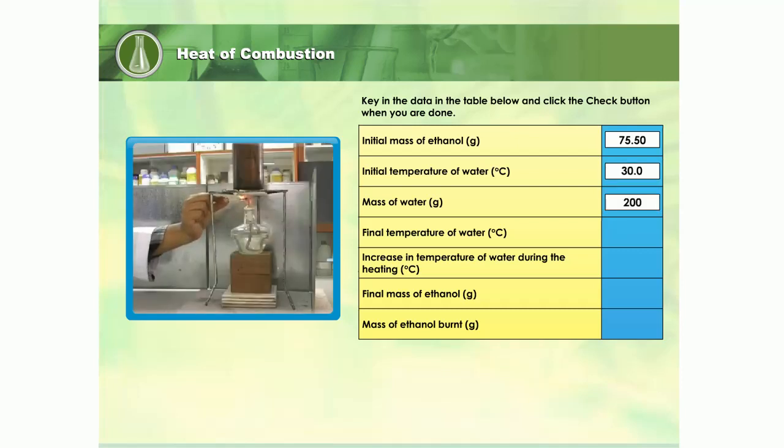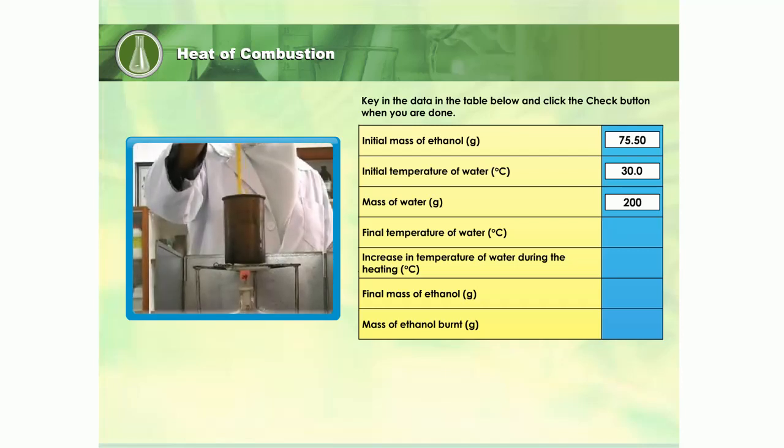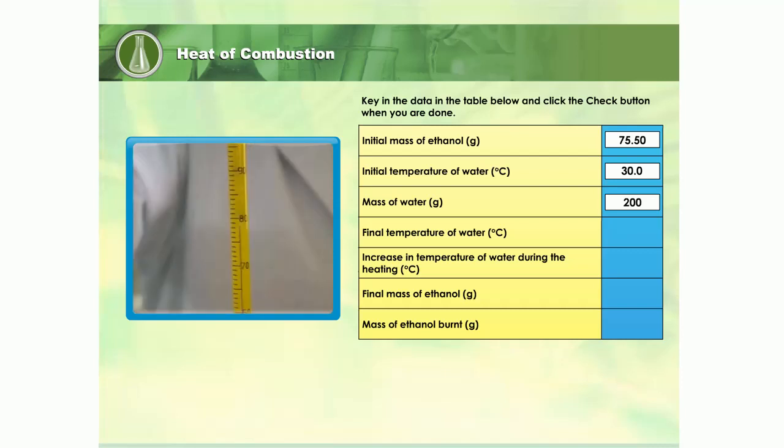The burner is placed below the copper can and then lighted to heat the water efficiently. The water is stirred until its temperature increased by about 50 degrees Celsius. Record the final temperature of the water in the table. What is the difference in temperature during the reaction?